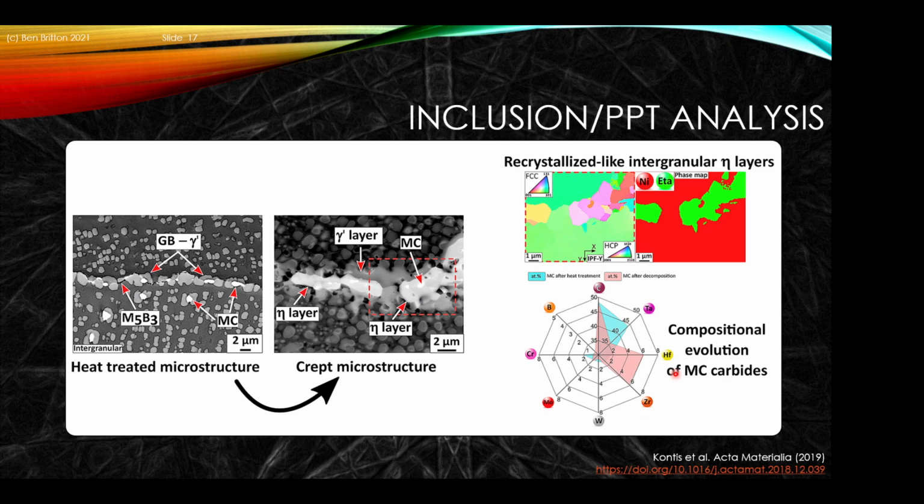We can also evaluate engineering alloys. We can evaluate, for instance, precipitates. We can look at their crystal phases and how they're present across the microstructure. Typically, we can look at larger domains or regions than are found in, say, a TEM type analysis. We have this spatial information, which is one up above, say, an X-ray powder diffraction analysis. And we can also link this with EDS analysis to look at the chemical variation. We can, of course, go across different techniques, so we can combine EBSD and EDS with extracting TEM foils to look at the details of some of those interfaces or chemistries.